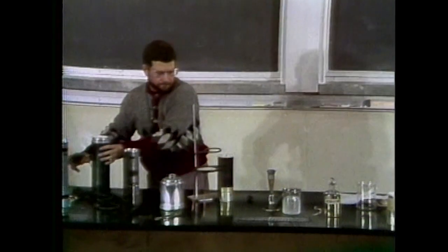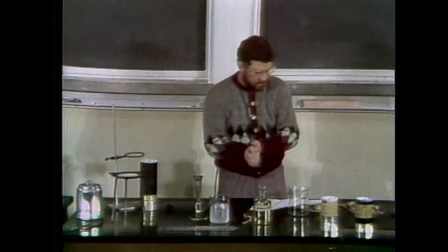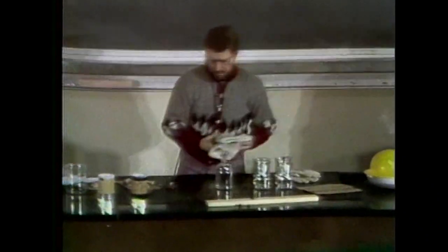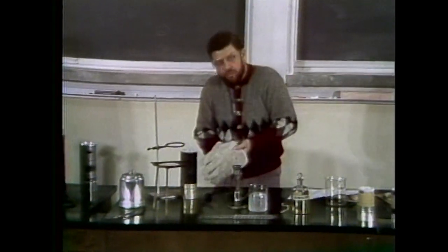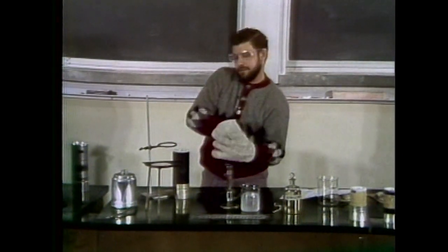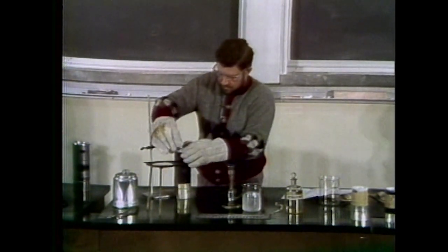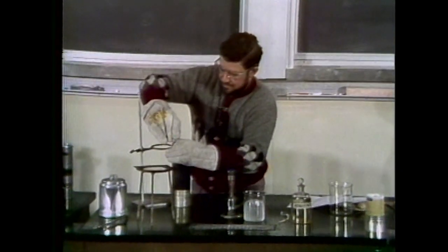And I better find my gloves here. Here are my gloves. They're a little awkward to work with, but they are safer in terms of what I'm going to do now.